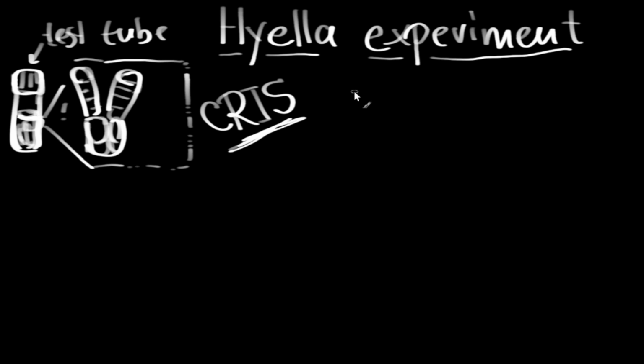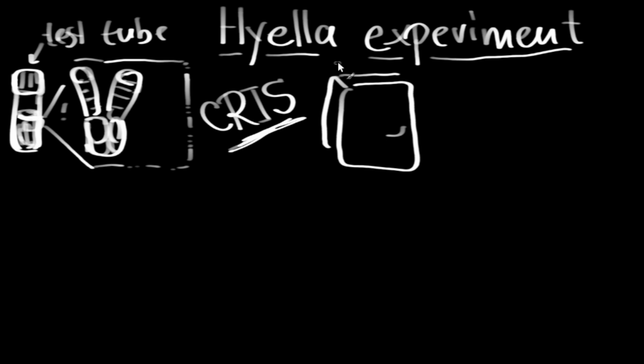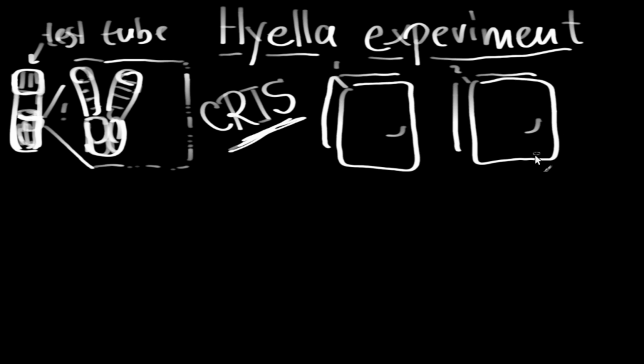What we're doing, so we have two refrigerators in the lab. It's gonna be the first one, and here the second one. And we measure light intensity in the first one, and we measure that in microeinsteins.